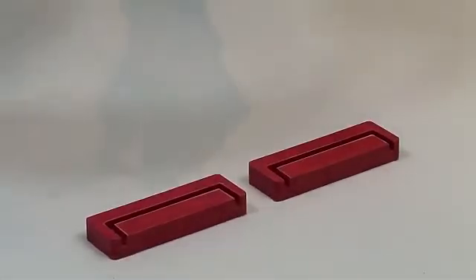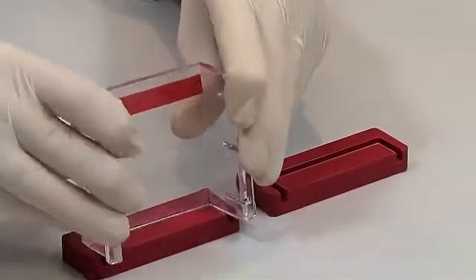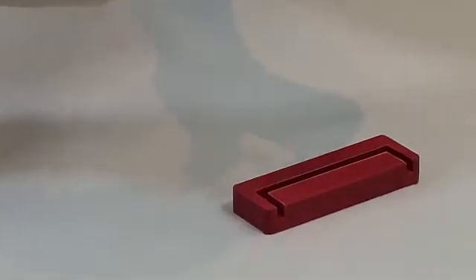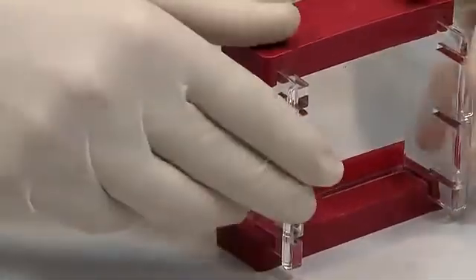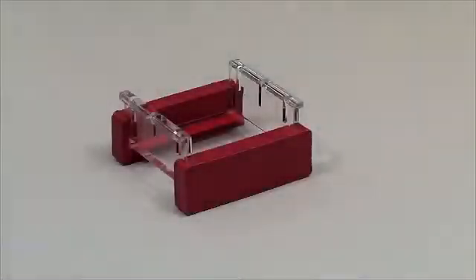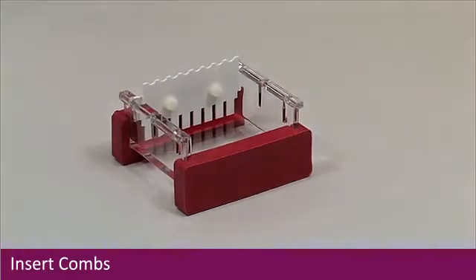On a level bench surface, begin to set up casting using the gel tray and plug and go casting dams. Carefully insert one end of the tray into the inner groove of a casting dam. Repeat with the second dam before checking that both dams are firmly in position at each end of the tray. Using the comb slots, insert the combs into the required positions within the tray.